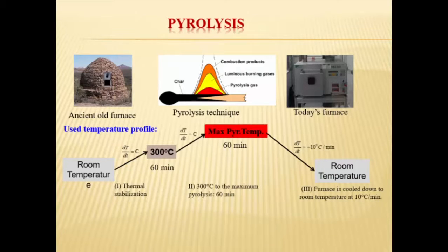There will be a step of increasing the temperature, because initially hydrogen will be broken before 200 degrees centigrade, and slowly all the other bonds will be broken. Based on this step, you get the quality of the carbon structures. If you do it very fast, there will be chances of getting porous structures.